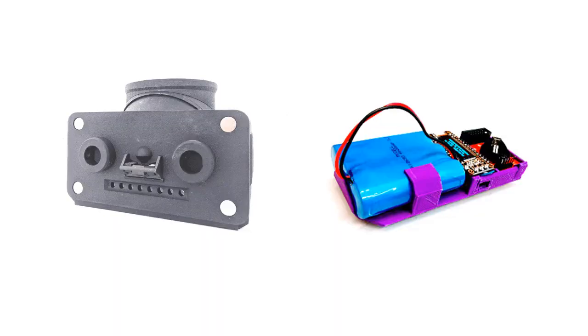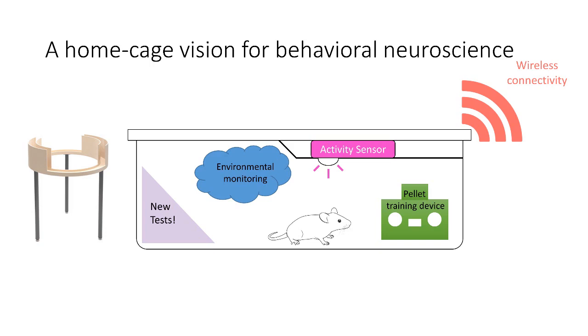So those are 2 devices that can be used independently. Each one logs data on itself and is completely autonomous. But in my vision, I said we're going to bring everything together and transmit it to the cloud. So in the final few minutes, I want to show you the progress we've made on that.